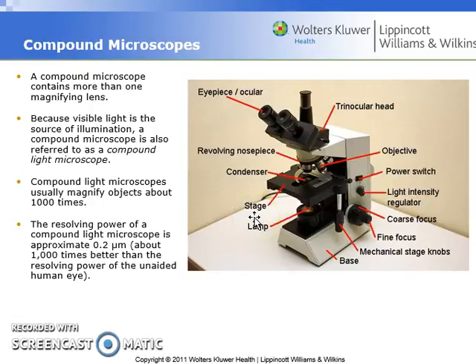And that's what's really great about these light compound microscopes, is that they're able to do that because of the compound nature of the lenses. You don't just have one lens, which is a 10x, you also have these different objective lenses.